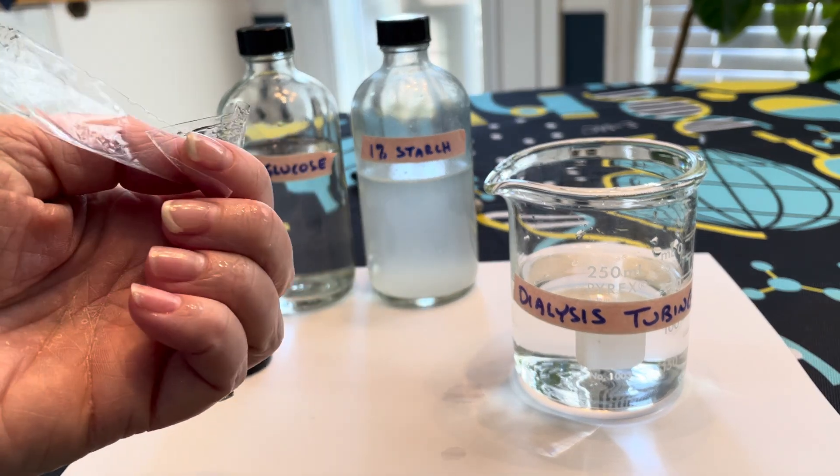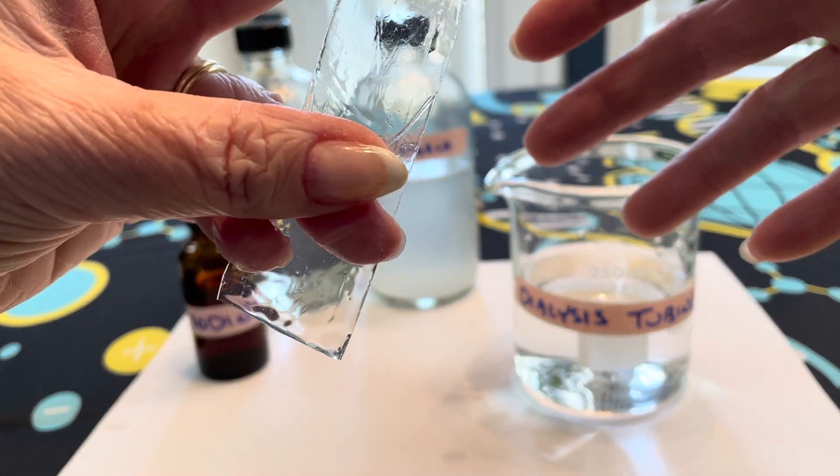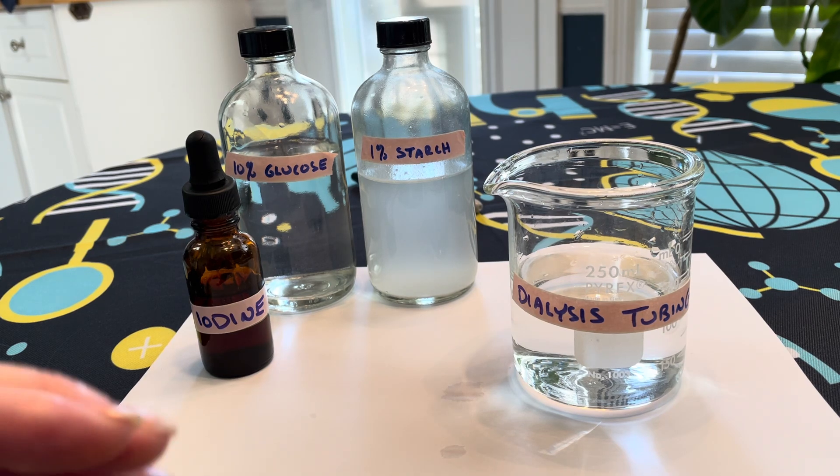The same thing is true for our dialysis sack in that some things can move through the walls of the plastic and other things cannot. That simulates our cellular membrane.